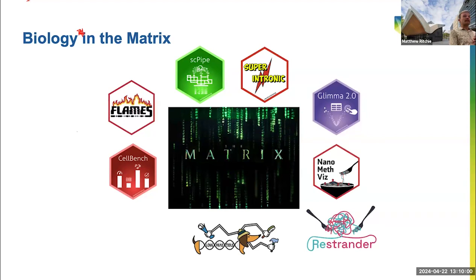And then in the long read space, methylation is a cool signal you can get from your beautiful long reads of technologies like nanopore sequencing, Restrander for doing some QC on long read RNA-seq. And we've got a database called Long Read Tools, which sort of collates all the different methods that are out there being developed to support long read analysis, be it DNA or RNA-seq or other applications.